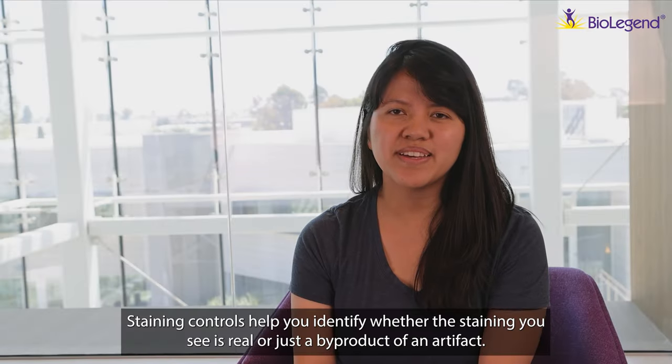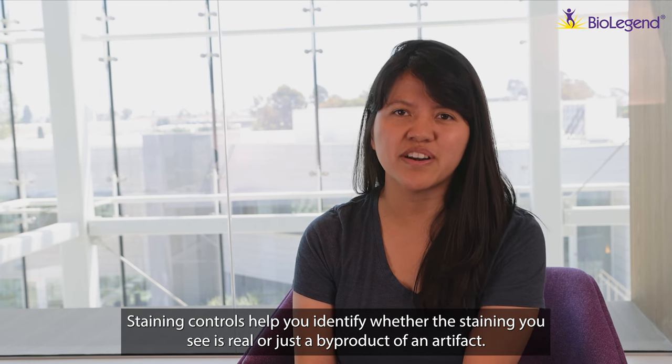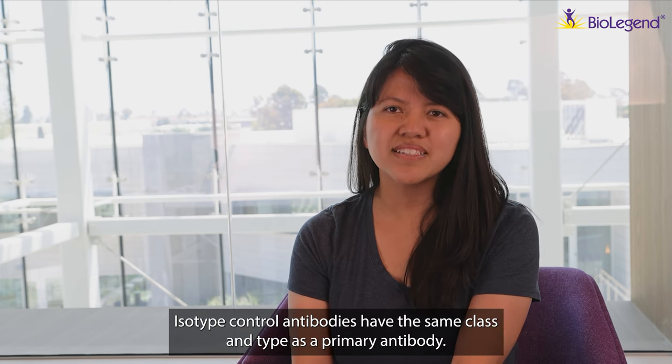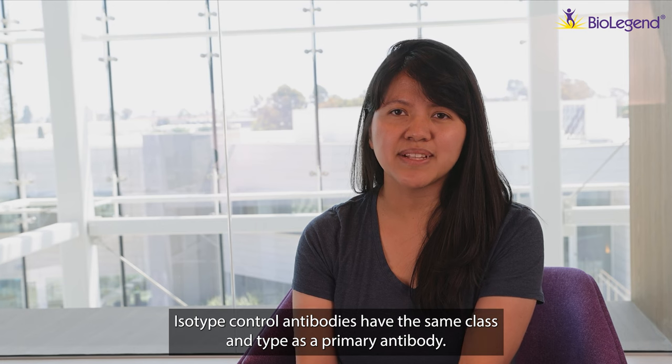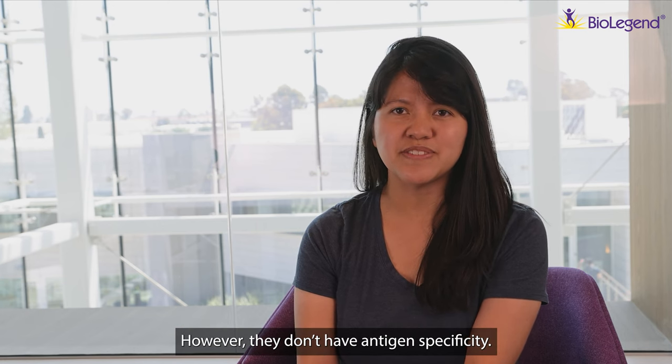Staining controls help you identify whether the staining you see is real or just a byproduct of an artifact. The first type we'll talk about are isotype controls. Isotype control antibodies have the same class and type as the primary antibody, however, they don't have antigen specificity.